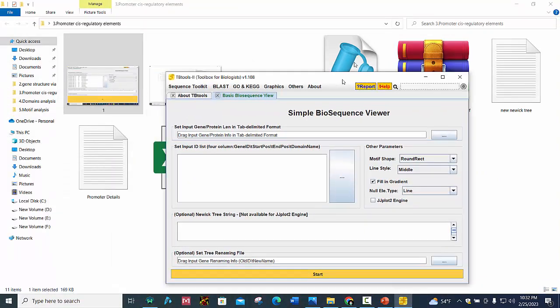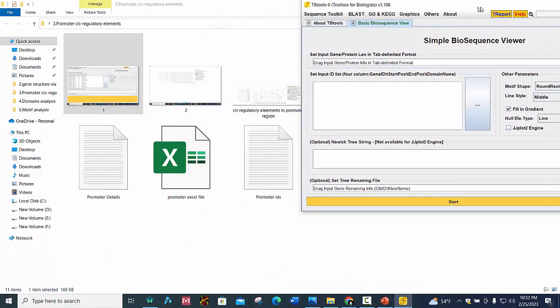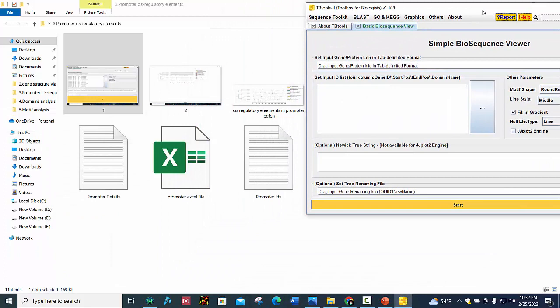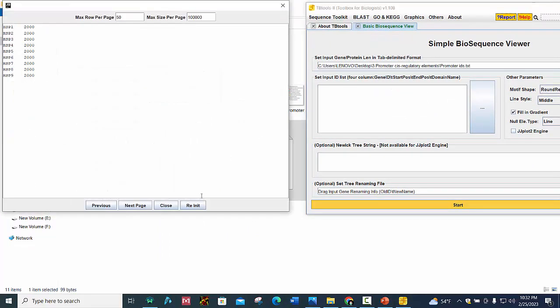So first is promoter IDs. We will place our file here.